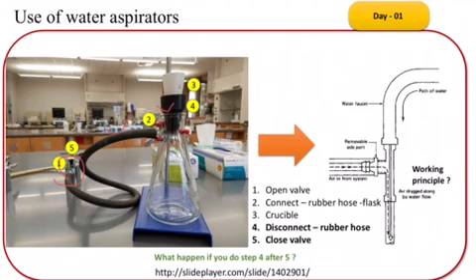to a filter flask. Make sure you have some DI water in the flask before starting cleaning the crucibles. Make sure you rinse the crucible with large amount of DI water after each cleaning step.